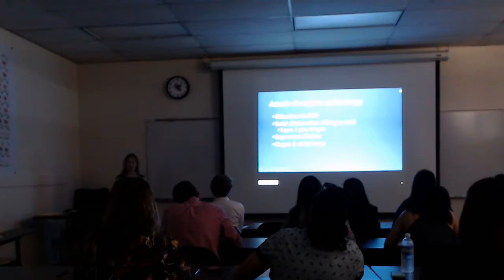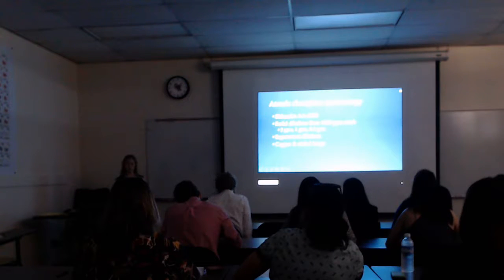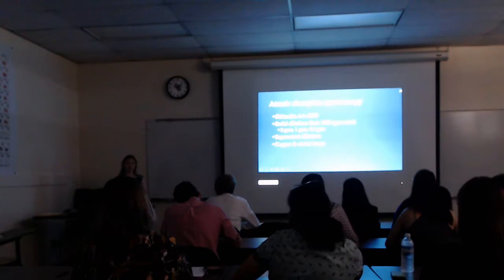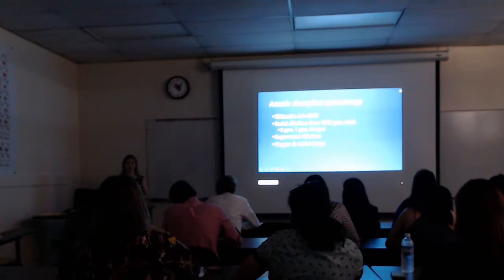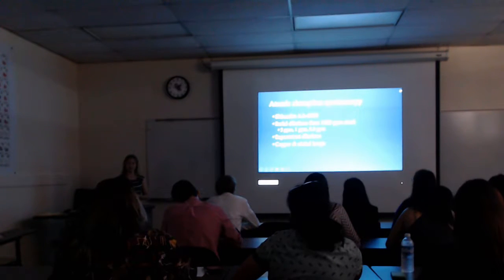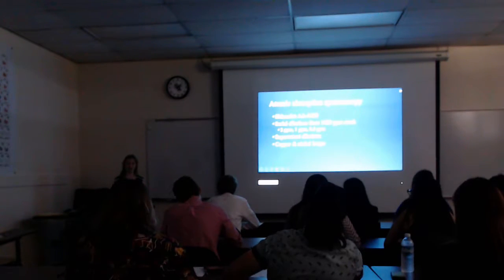So after that, we decided to try the atomic absorption spectroscopy. On the AA, we had to dilute our supernatant because we had to ensure it would be in the linear range between 0.5 ppm and 2 ppm. We also, of course, had to use the copper and nickel hollow cathode lamps because this is the AA and they are very particular to that.